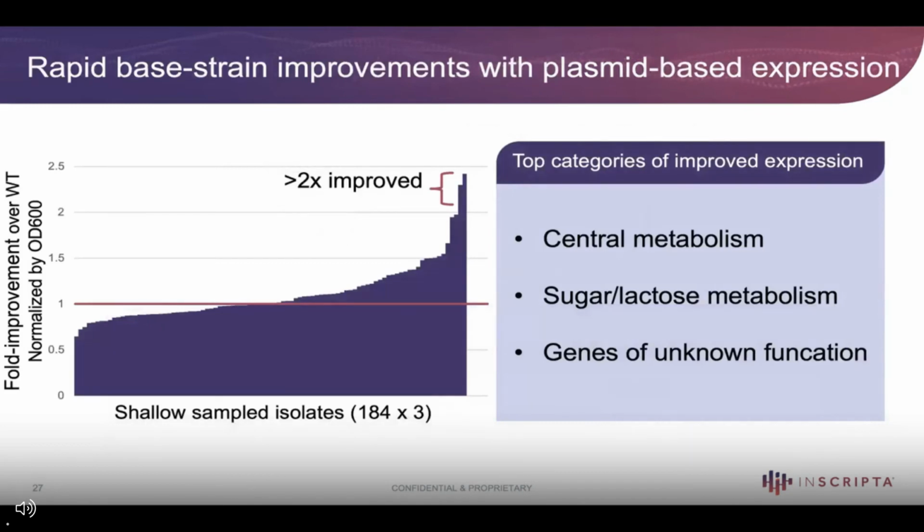So again, we're seeing once again that doing this with an extremely small, shallow sample, from the 10,000 different variants that we could have been screening through, I've screened just a couple of plates and replicates to be able to see that induction off of the plasmids.